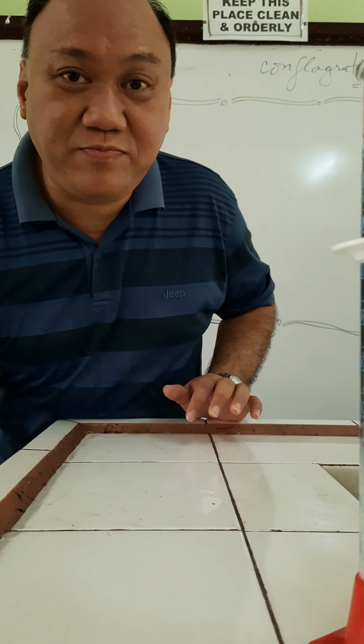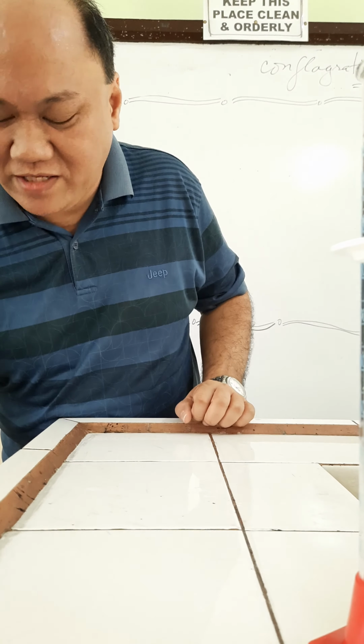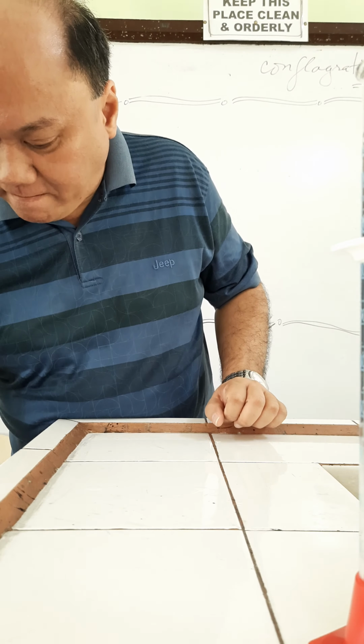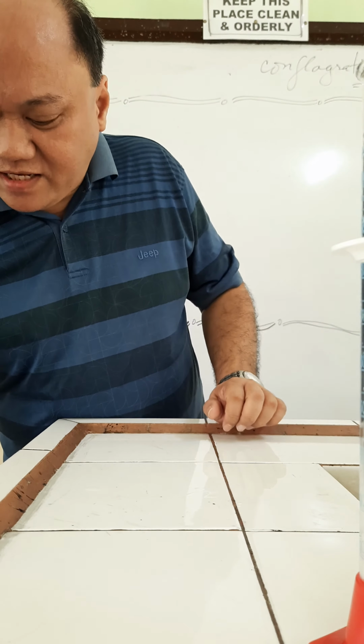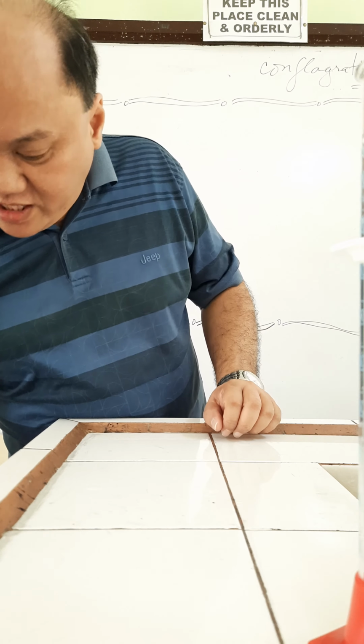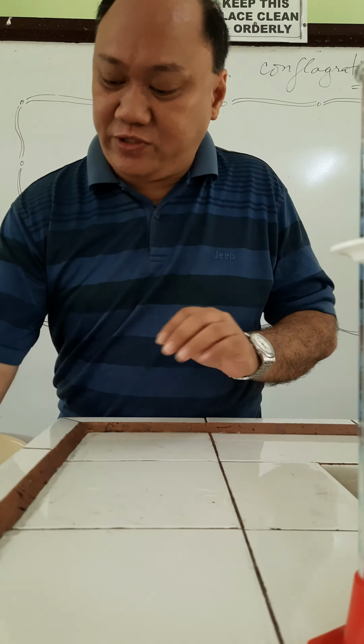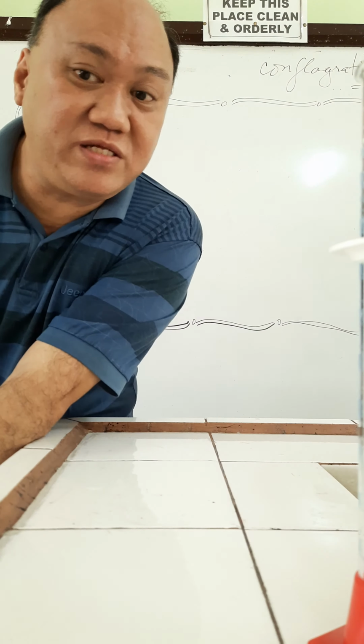Hello class, let's proceed with the second part of procedure number 1. So that was the first part. The second part tells us to measure volume of a certain amount of liquid using our 3 beakers.